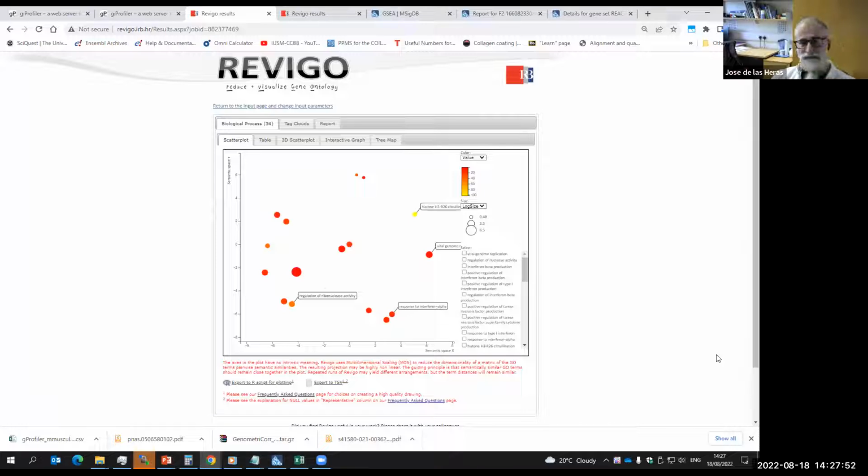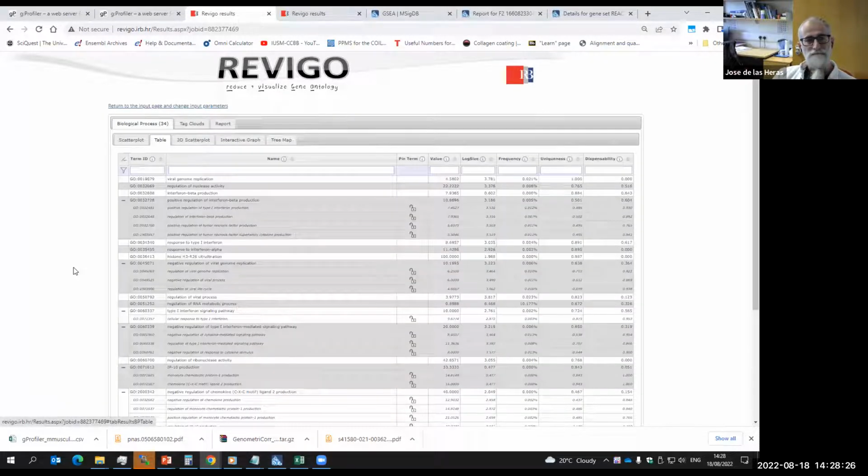It's really fast. So this is the other type of representation that some people use. I personally don't like it because it doesn't seem to provide much information compared to the box plots or the bar plots that I have. But if you like it, it's a way to do it. You can export the R script here, so you can reproduce this graph or change it to whatever you like. And you can export the data as a tab delimited text file. You can view the table here.